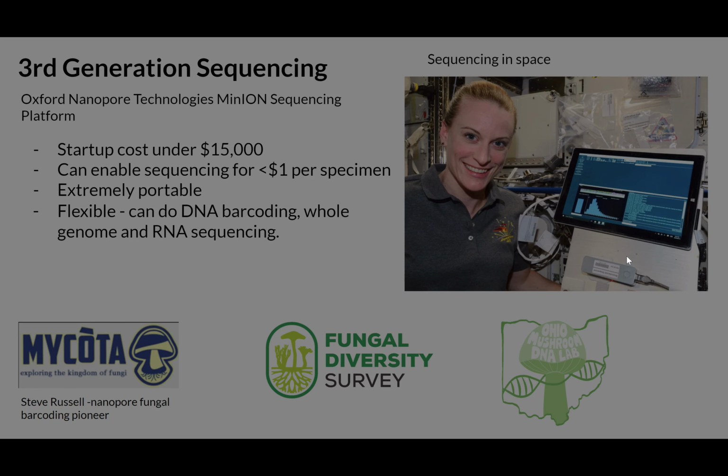This device is extremely flexible. So you can do short read sequencing, long read sequencing. It has a theoretical capacity to sequence reads that are up to and over 1 million DNA letters long by itself. You can also do RNA sequencing. So for mRNA or other types of RNA, you can sequence that directly without having to generate cDNA. That's another topic.